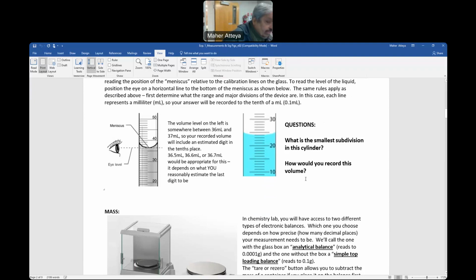Then we'll learn how to do this, this is not a cube. Okay, so we'll have to determine its volume. So the volume of it will be, you look at this way horizontally, or this is vertically. You can look at horizontally, but it does not really matter. So that will be your length here. That will be your height. That will be your depth. If you look at that vertically here, that will be your height. That will be your length, and that will be depth, height, and length.